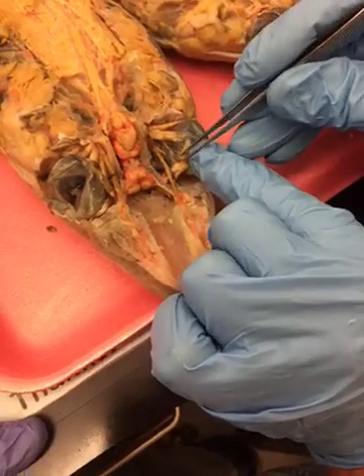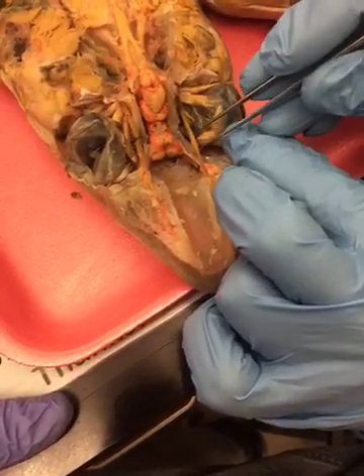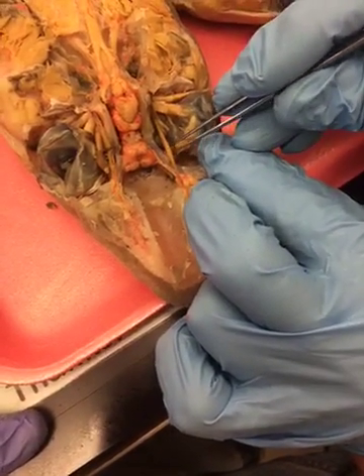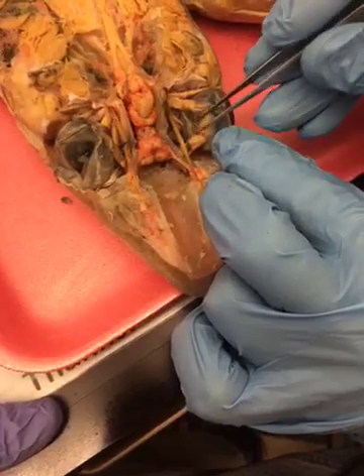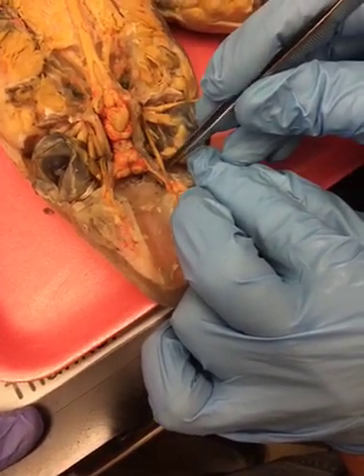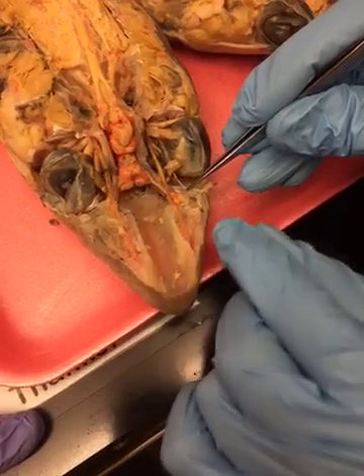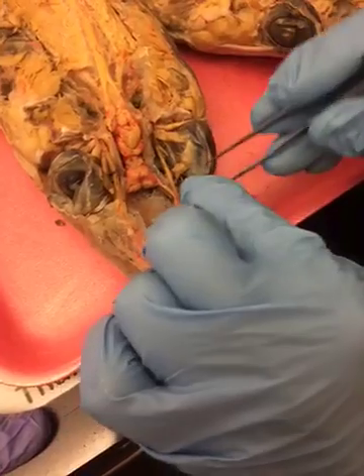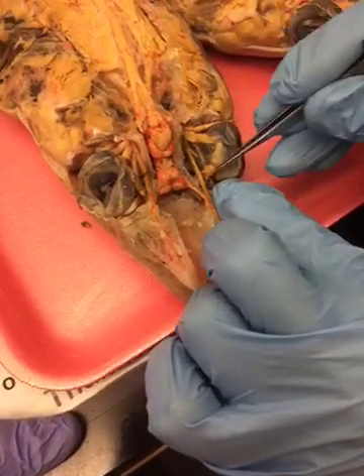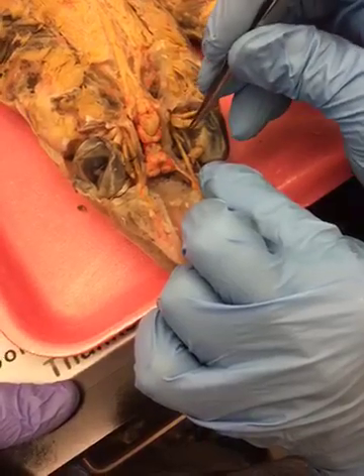Now, it looks like it's going to this muscle here, but you know that's the dorsal oblique, which is actually innervated by the trochlear. And in fact, the deep ophthalmic nerve continues along. Here it is. So here's the deep ophthalmic here, and there it is continuing into the nose. Okay? Now, I'm going to pin it there.